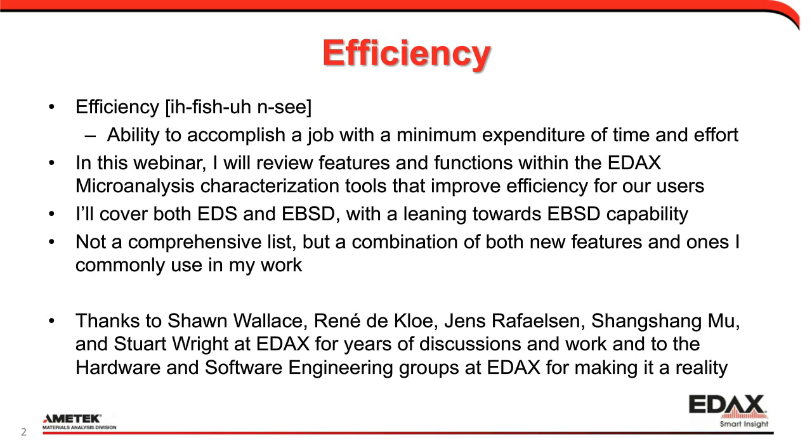And most importantly, this is not really a comprehensive list of things, but it's a combination of some new features that have been developed. We've developed a number of products over the last 12 to 18 months that really help improve efficiency, and also ones that I've commonly used in my work, both recently and over a longer term.